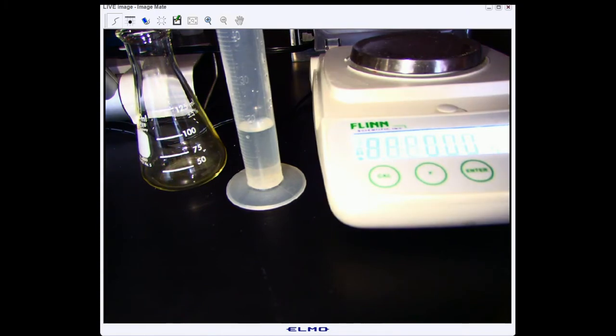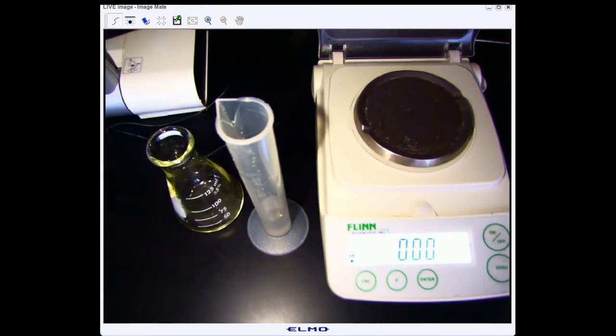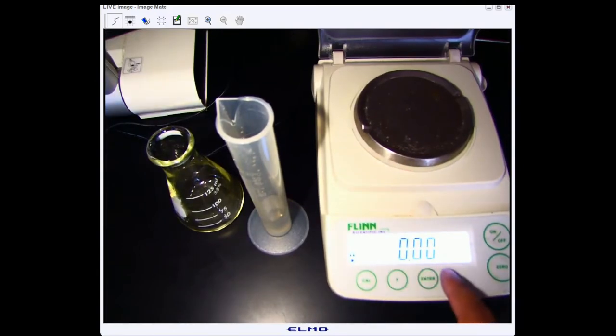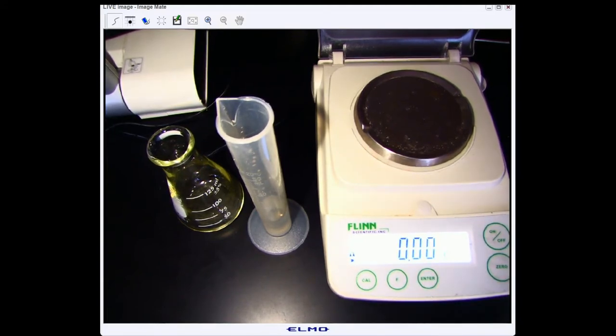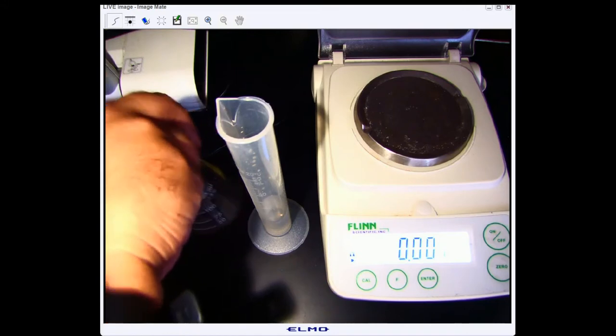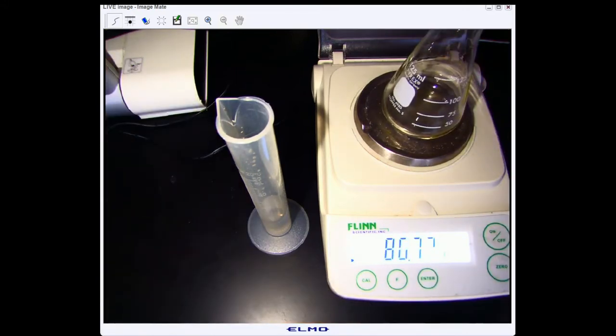What we're going to do is make sure that our scale is displaying all zeros. If it wasn't, we would press the zero button to make sure it does. Then we're going to get the mass of our empty flask here and we'll record it in our data table.